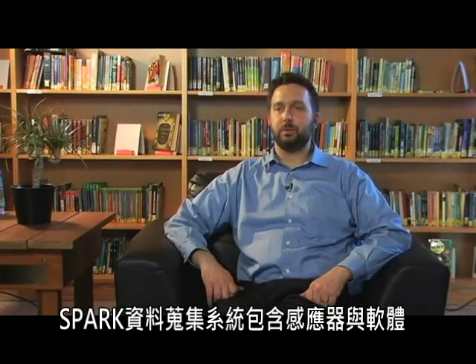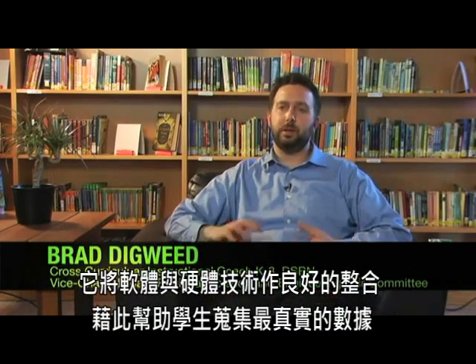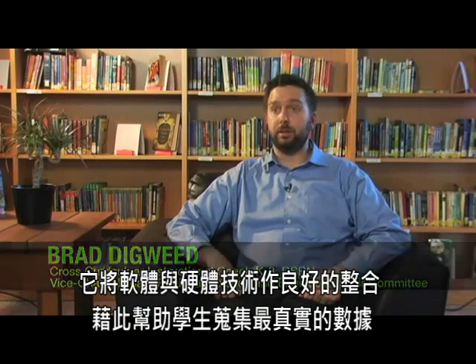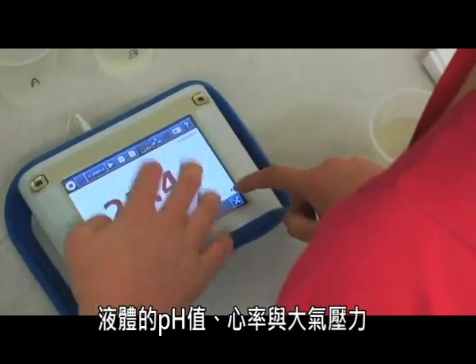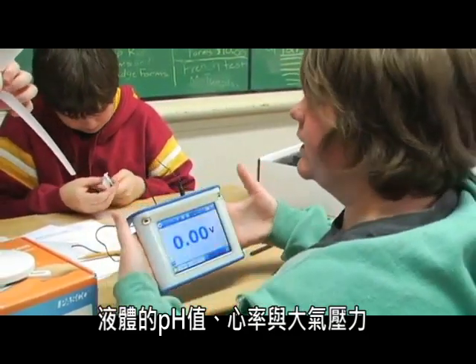The Spark data logger system, with its sensors and software, is a way of marrying software and technology so that students can actually collect really authentic data, and a lot of different kinds of data. So they can collect temperature settings, they can get dissolved oxygen in liquids, pH values, heart rate, pressure.